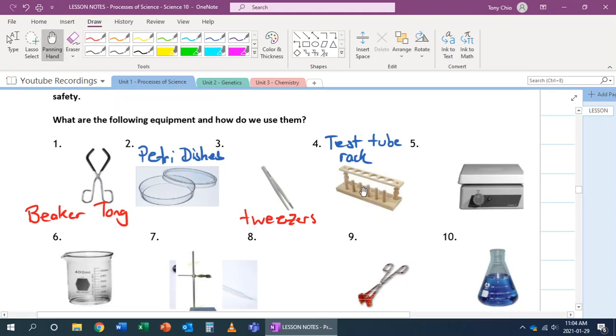This is for you to be able to hold and conduct multiple experiments together using test tubes. Because test tubes, number one, don't stand well. They don't stand at all. Because of that, you need a way to hold them without your hands.